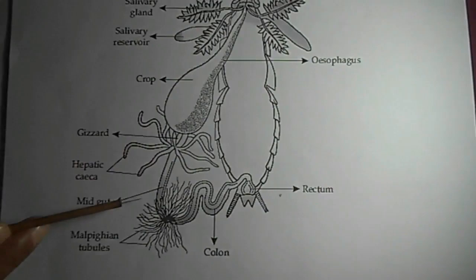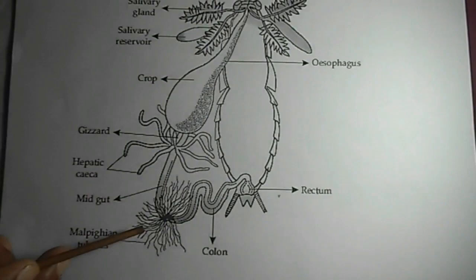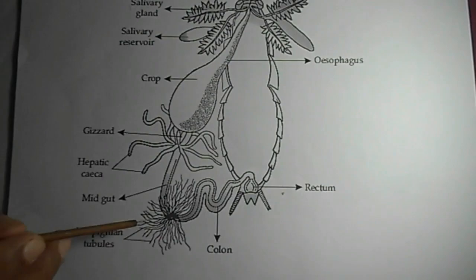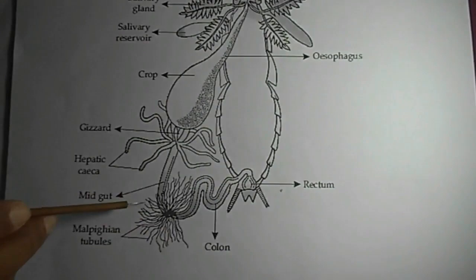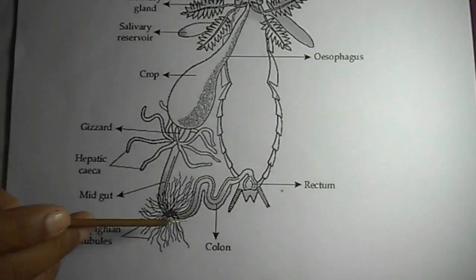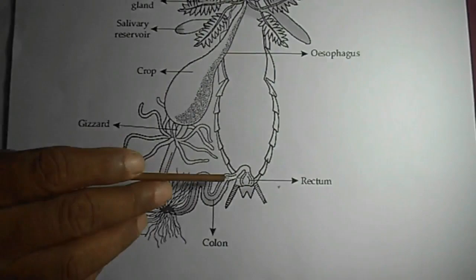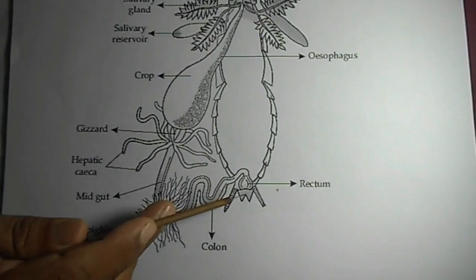After the hepatic caeca, this tube-like structure is called the mesenterone or midgut. The midgut continues up to the starting point of the Malpighian tubules. These are greenish, yellowish tubules which emerge from the digestive tract. This is actually the main excretory organ. From this point, the last part is called the hindgut, and it consists of the colon.